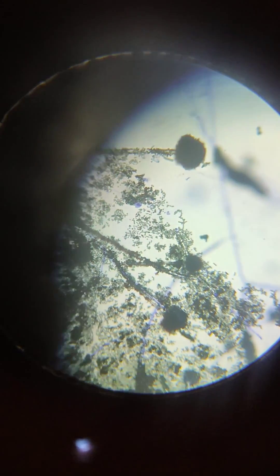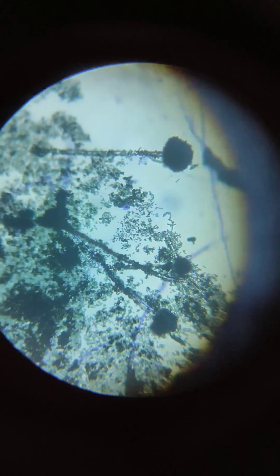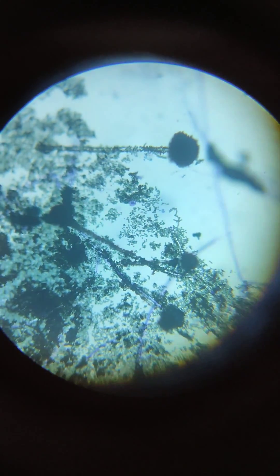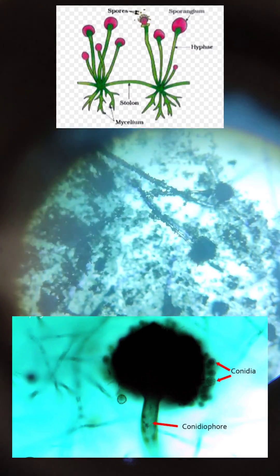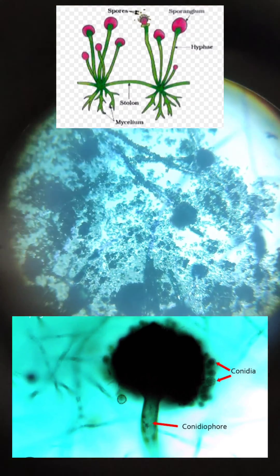You can observe that there is one round-like structure and small dotted-like structures. The small dots are the spores, and there is one stick-like structure also. This stick is called hypha or conidiophore.